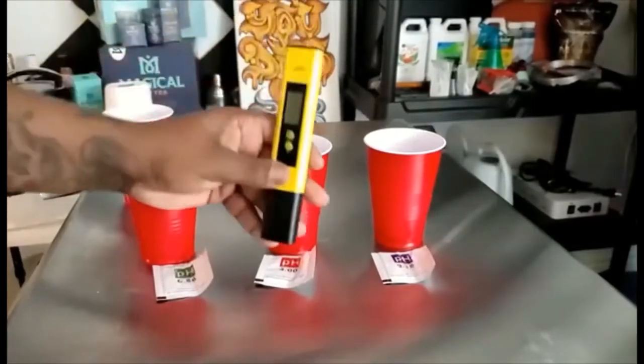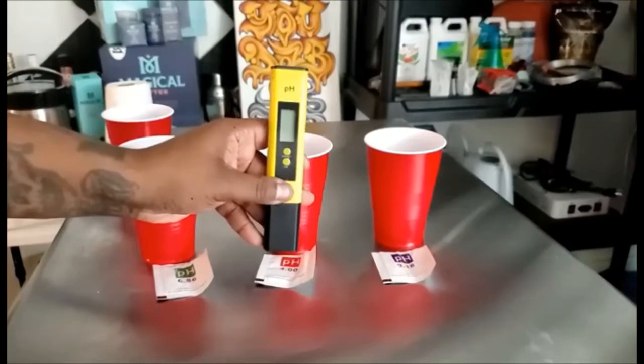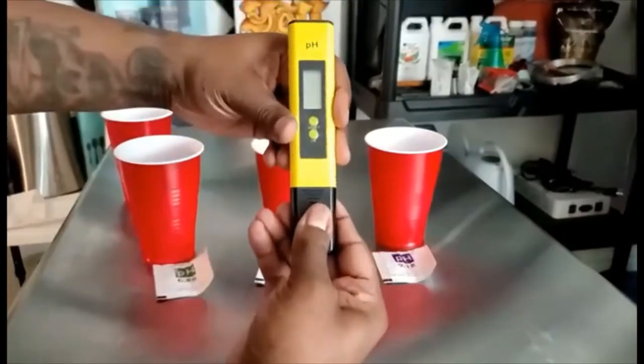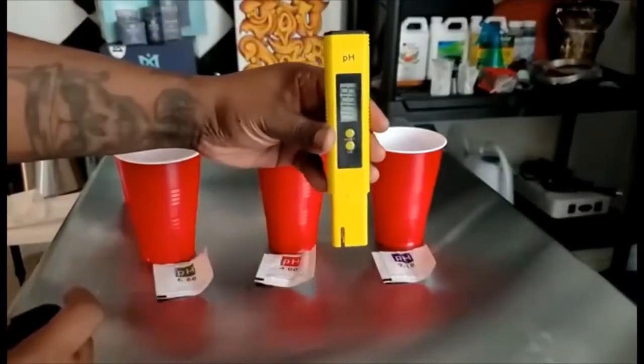Now that that's done, let's get our meter out. We're going to calibrate our pH tester. This is very important — this is where I messed up, and my first 10 days of growing didn't go so well because I did not do this step.